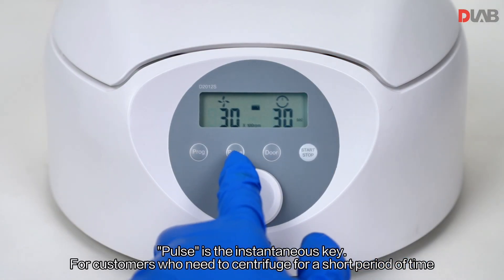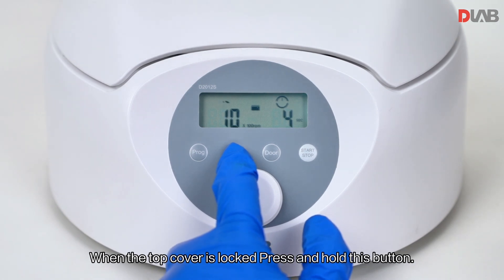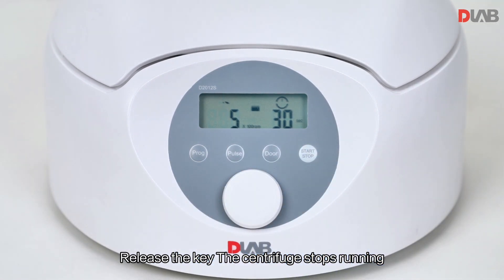For customers who need to centrifuge for a short period of time, when the top cover is locked, press and hold this button. The centrifuge runs at a higher speed until the set speed is reached. Release the key and the centrifuge stops running.